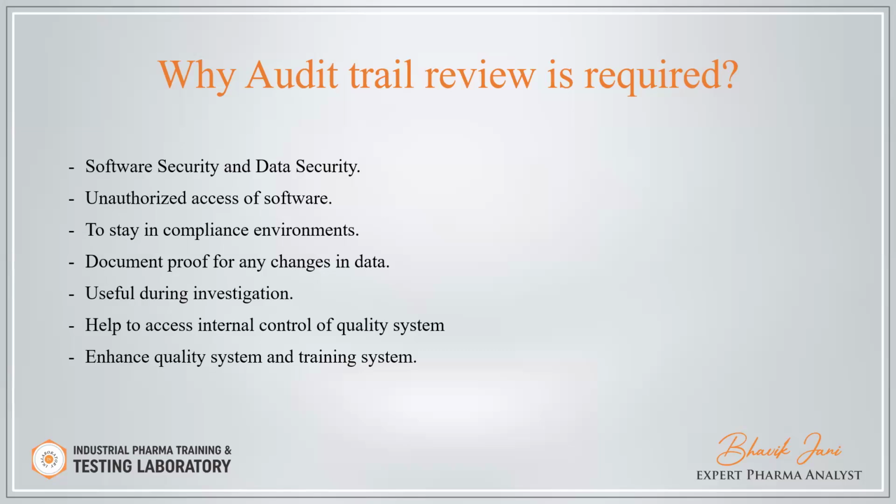Likewise, if the analyst does not enter the proper comment in the software during data save, method creation, sequence creation, or analysis, you can give the training to enhance your system.